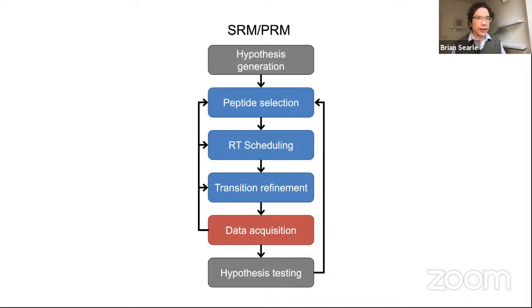In this particular case, Gabriella, boxcar you wouldn't want to use to build a library, because you actually need a library to analyze boxcar data. You aren't necessarily collecting fragment ions, you only have precursor ions. So you don't necessarily know what the particular peptide sequence is, you just know what the precursor signal is, because that's all you have time to do.